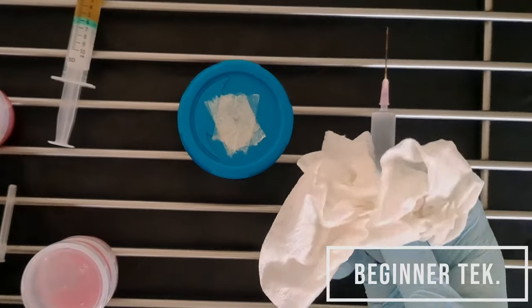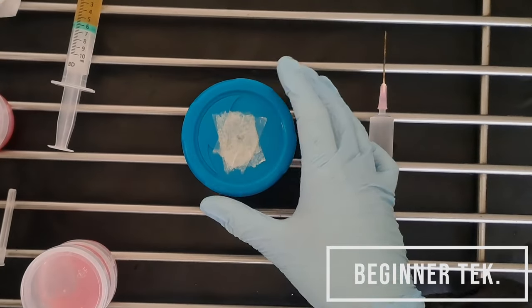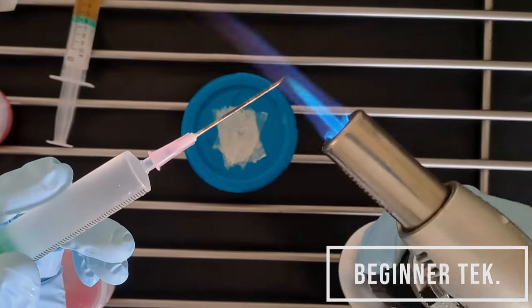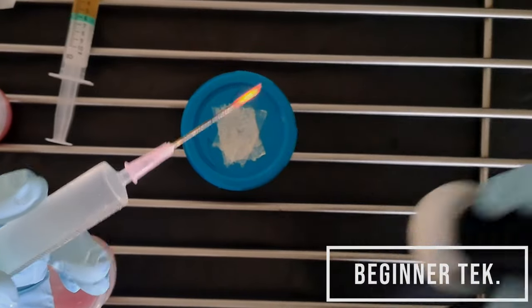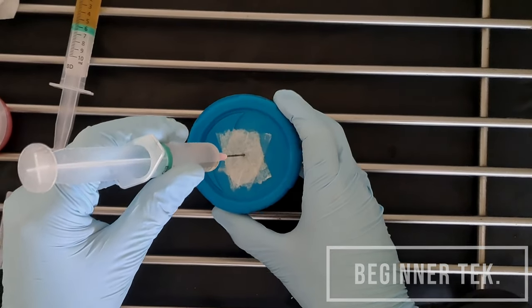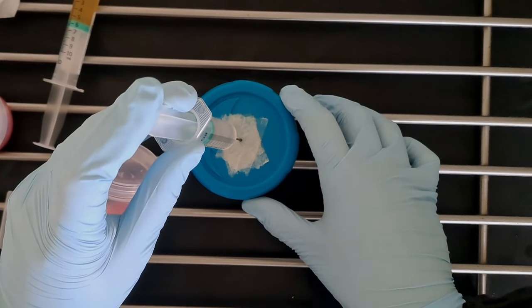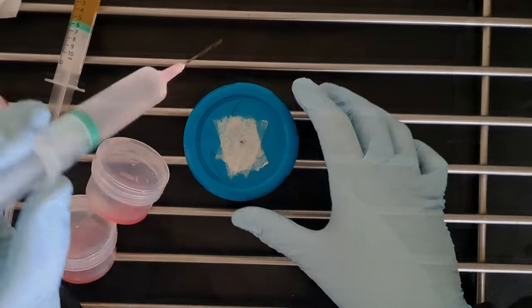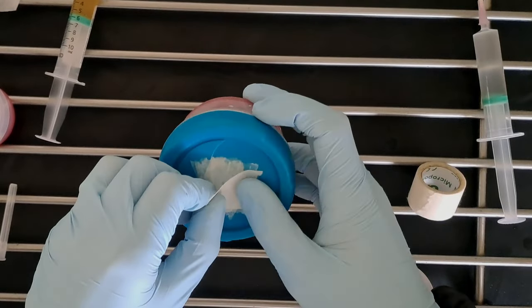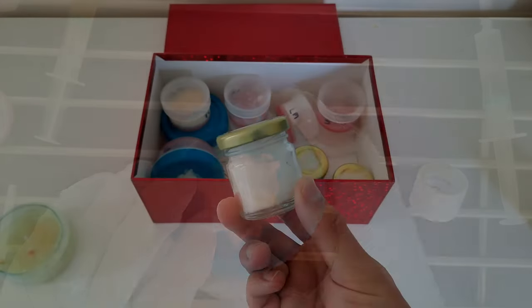For the modified pot with the hole in the lid, you can inject through the hole and then replace the micropore tape after inoculation. Finally, secure the lids on all of your pots and then store. Your agar pots will be ready to use in about 7 to 14 days.